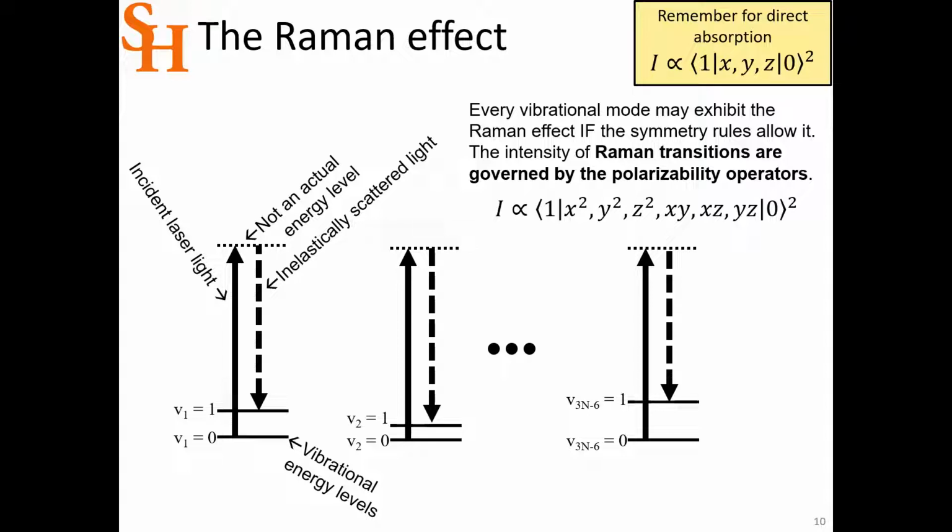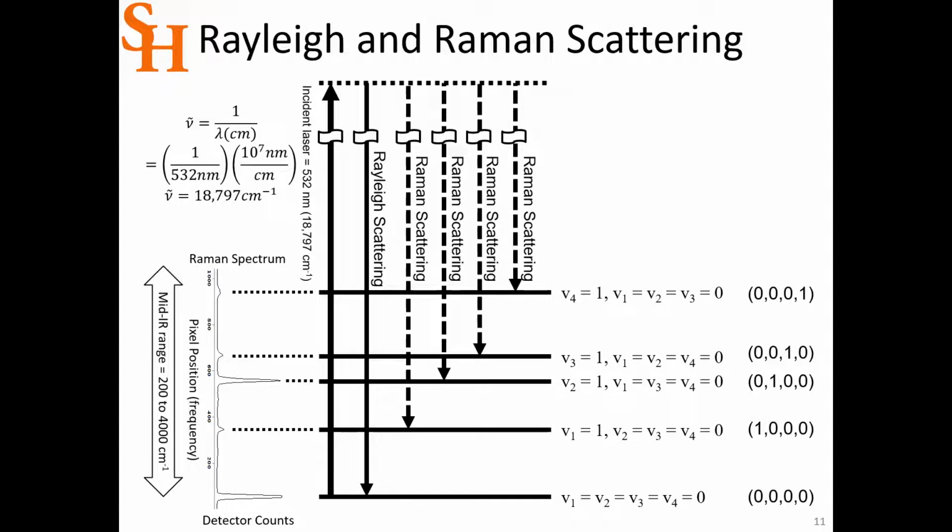But there's also a thing called the depolarization ratio. You're going to ignore that for this week's lab, but that's what you would use if you wanted to model this cross-polarized experiment. And so you could go in and see what the spectrum would look like with cross-polarizers or with uncrossed polarizers, with vertical polarizers. And then now we have this idea where every one of these different vibrational modes has its own peak.